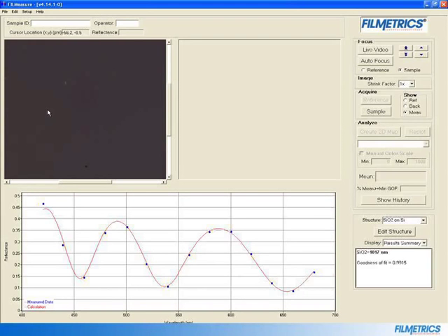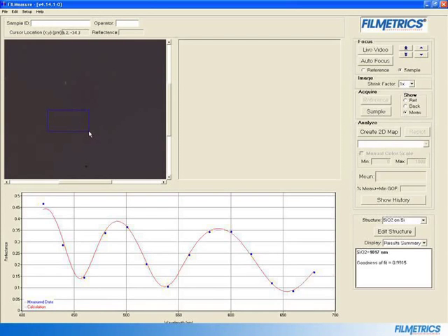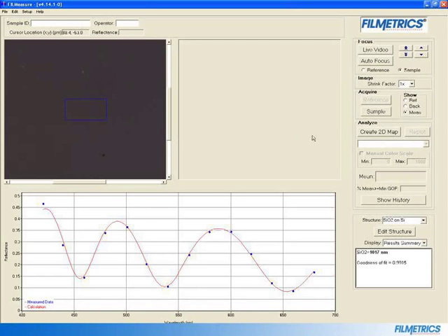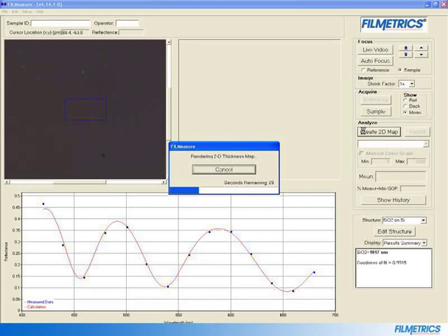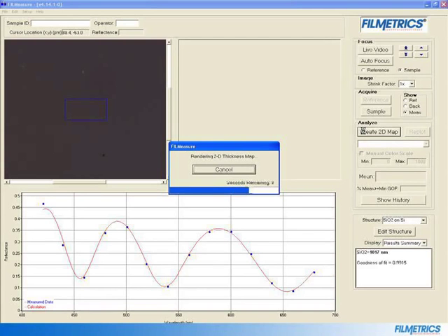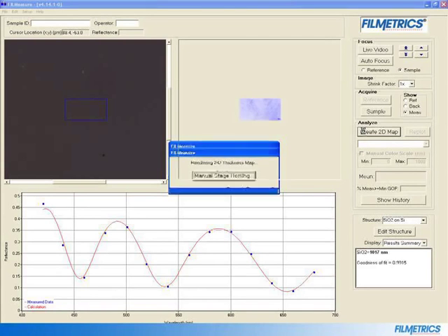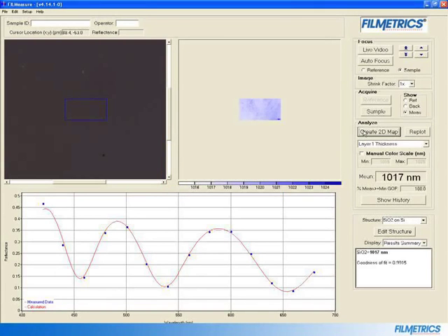Click and drag a box on the video portion of the screen. Then click Create 2D Map. This will render a two-dimensional thickness map of the portion you have selected. The time it takes to render the map depends on your computer's processing speed, as well as the size of the area and the number of layers you wish to map.